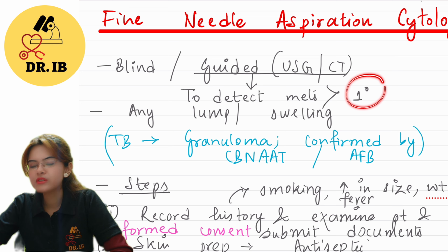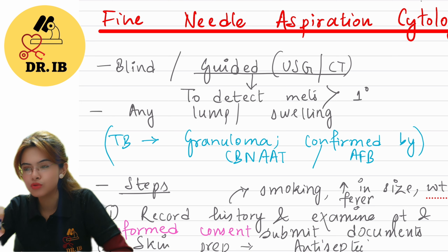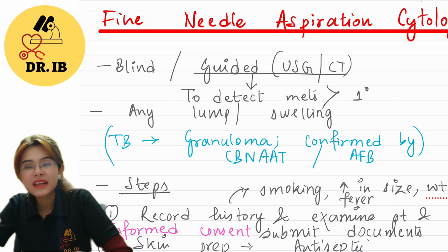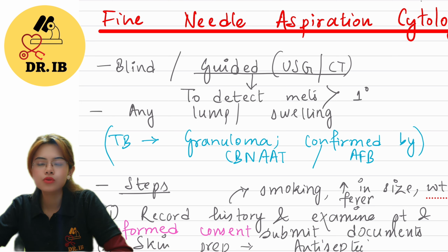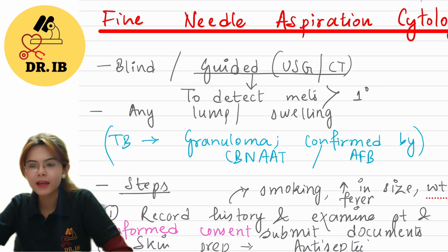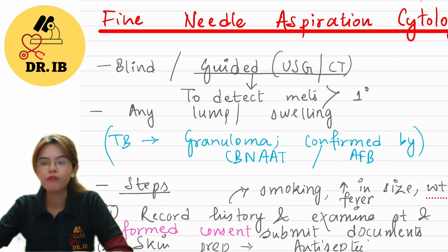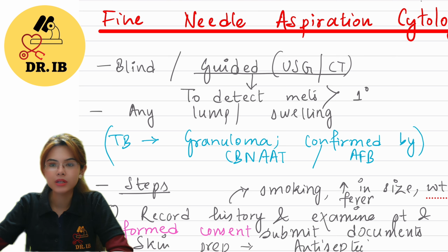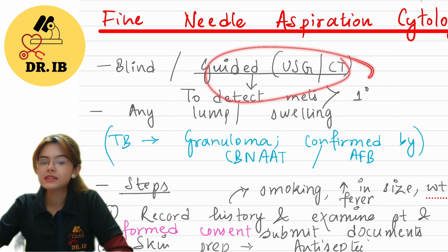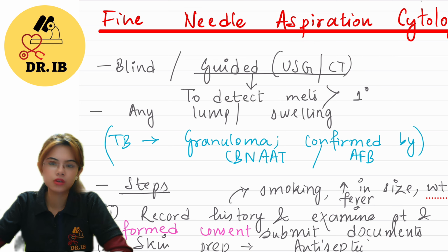Okay, primary तो obviously होता है, लेकिन mainly whenever a guided FNAC slide comes to you, you must take proper history of the patient, क्योंकि उसको तो आपने खुद नहीं किया है, वो करके आया है, वो आपके पास में स्लाइड लाया है, तो उसका आपको बहुत अच्छे से हिस्ट्री लेना चाहिए, because you must take the history of a malignancy happening anywhere in the body. That means the FNAC is done to suspect metastasis from that malignancy in the organ that you are doing.